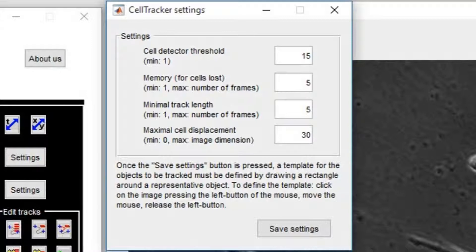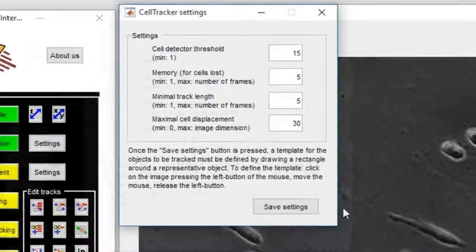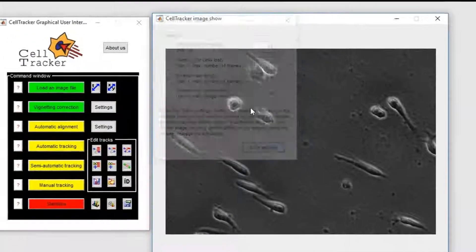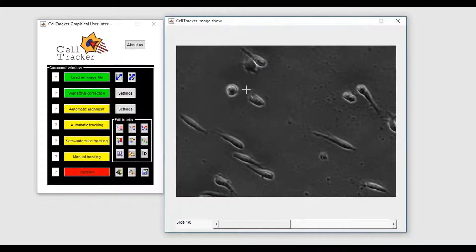To compute the maximal expected displacement, you have to look at the position of a cell in two consecutive frames and measure the approximate shift in pixels. Let us play with the automatic tracking modality.